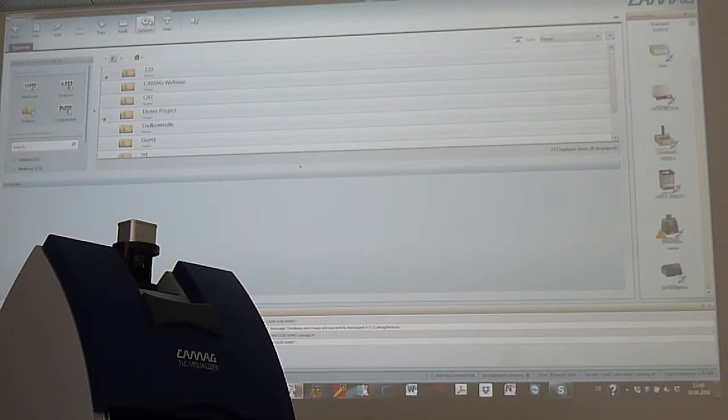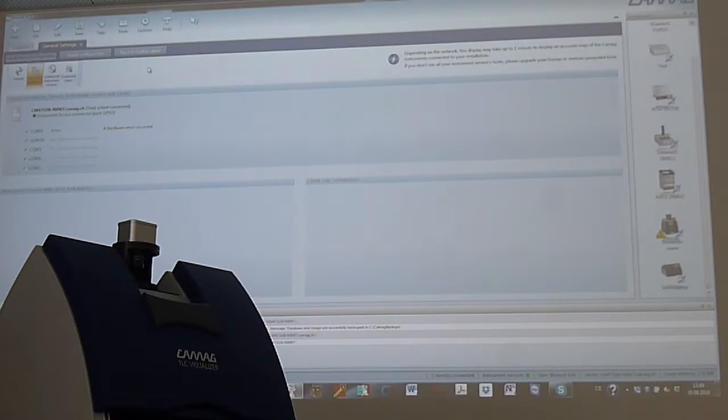Best would be to close it and reopen it. So that's it. Now we still see no connection, no instrument. Why is that? For that we have to know Windows a little bit better. Bill Gates likes to make it difficult for all the people. If Windows recognizes an error on a COM port, it says, "Oops, something is wrong. Shut down all COM ports."